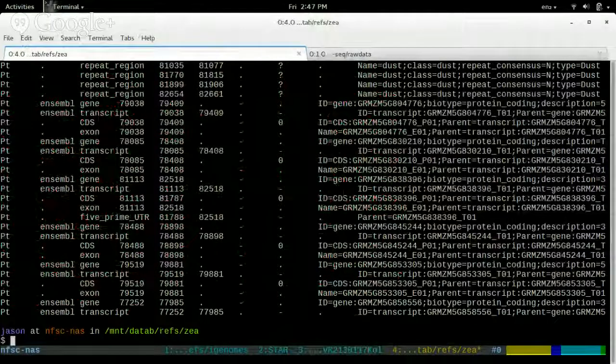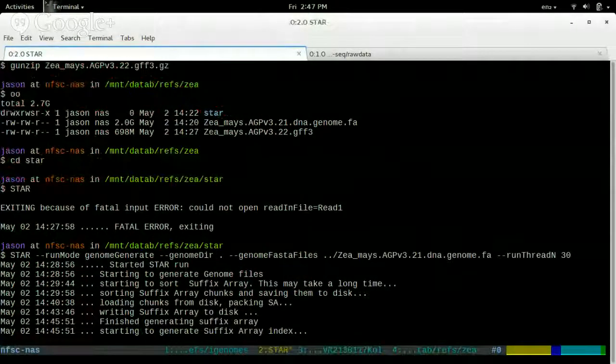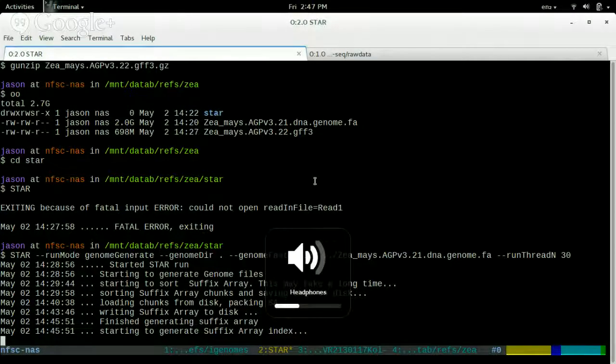Do you understand what we're doing right now here to the reference genome? No. Wait, say that again? Are we, right now, trying to map the annotations to the correct spot in the genome? Close. And actually, that's a good point. I forgot to give it the annotation here.